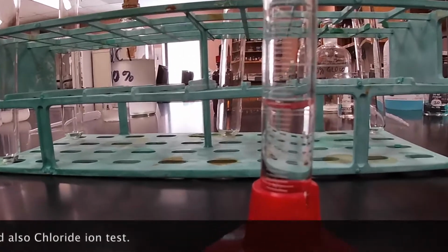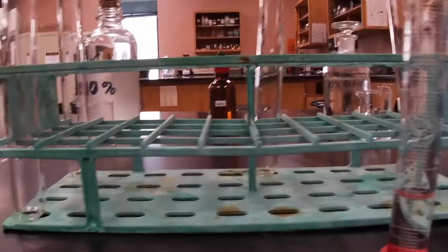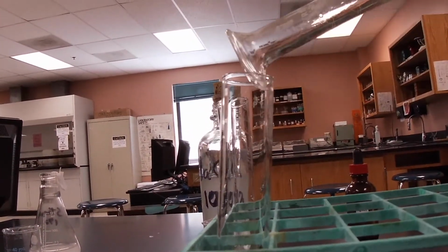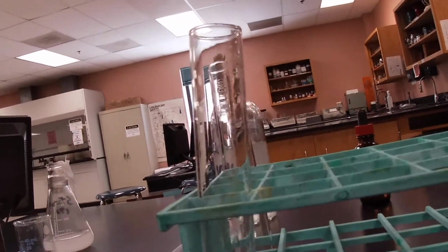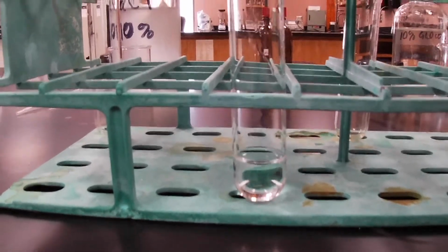And again, like I said, the only reason why we're doing this is so that this can be our standard, so that we don't have to use a graduated cylinder. And like I said, all of these are for qualitative purposes. They're not for quantity. So that means we're just trying to see what actually happens, right? We're not after any kind of measurements. And so that's approximately 3 milliliters of water. So we're going to use this for our standard.